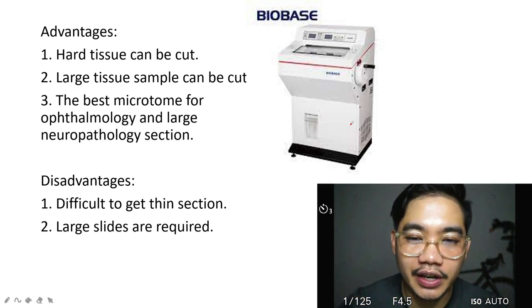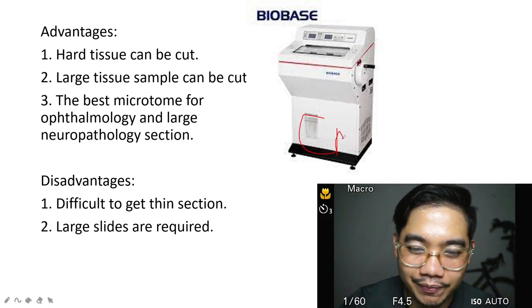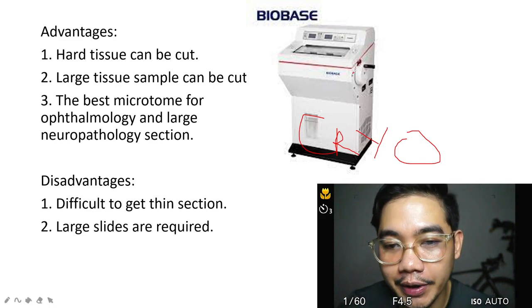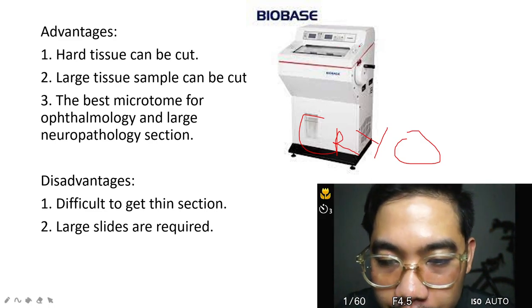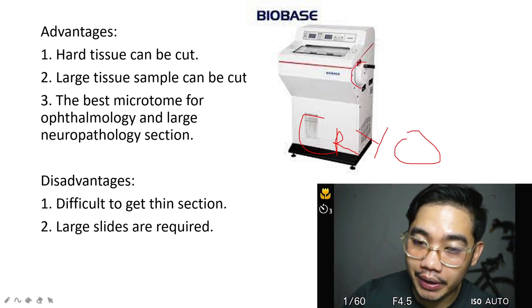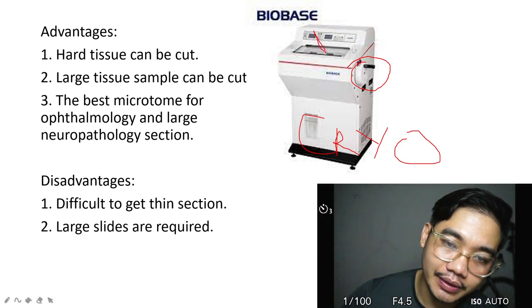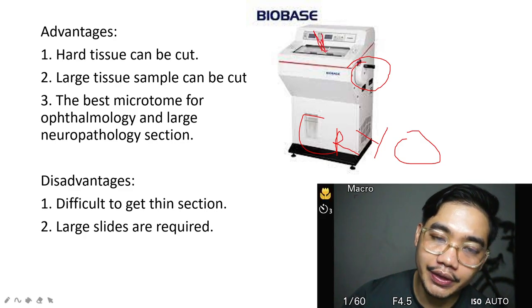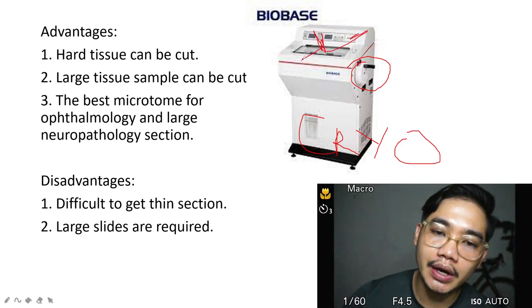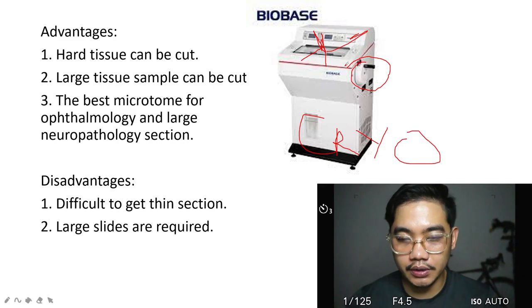No? So this is an error. This is a cryo. It's a cryo microtome. No, namali na akong butang. But this is a cryo microtome. I will show you a video later. Just think of a cryo microtome as a rotary microtome. That's your flywheel. But everything happens inside a very cold environment, no? So I'll show you later.